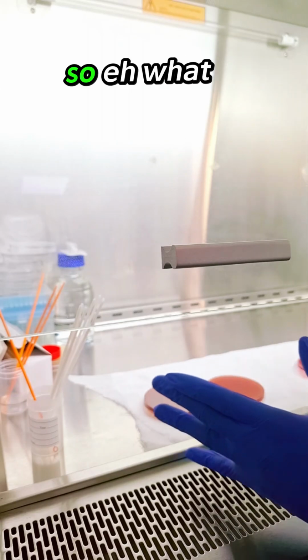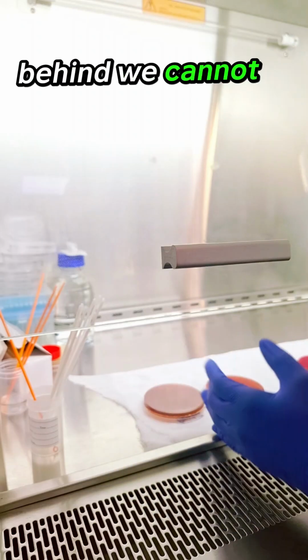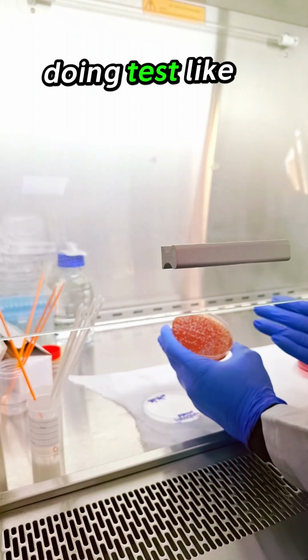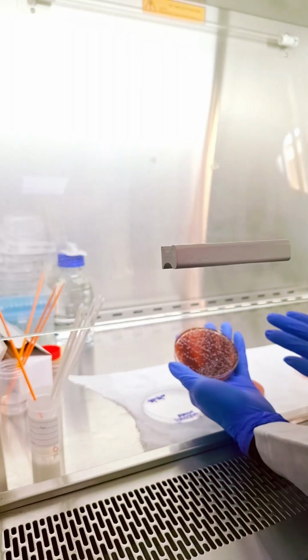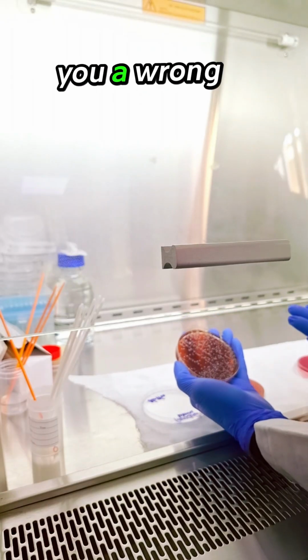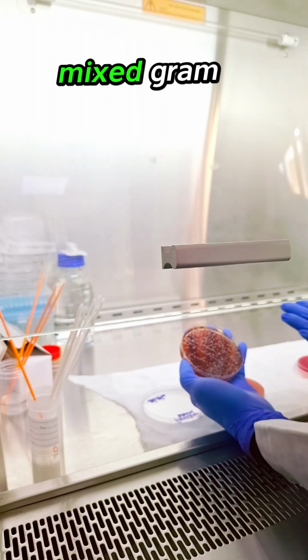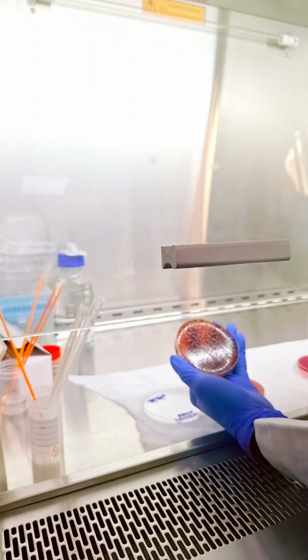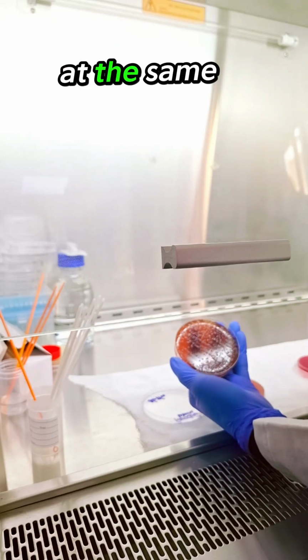So what is the reason we cannot use a mixed culture? One, when you're doing tests like the gram stain, it can give you a wrong result. You can get a mixed gram reaction, with gram positive and gram negative at the same time.